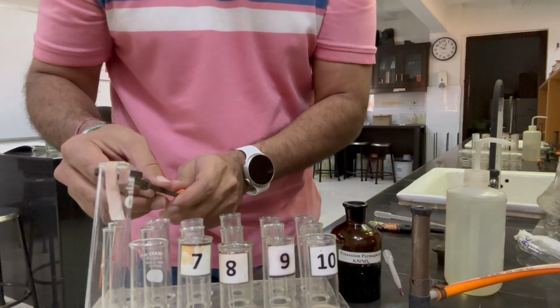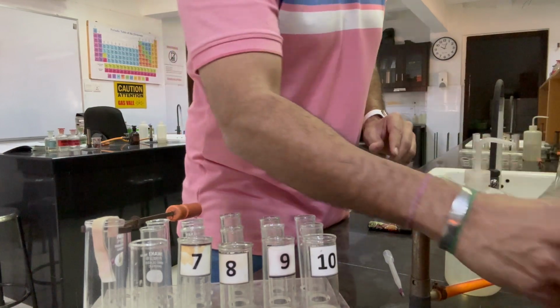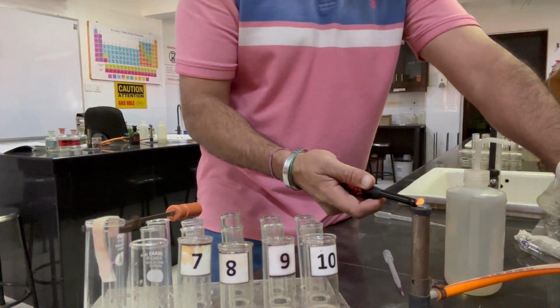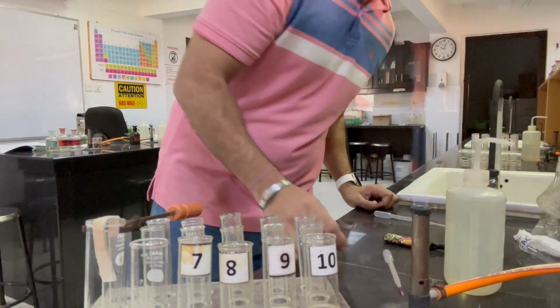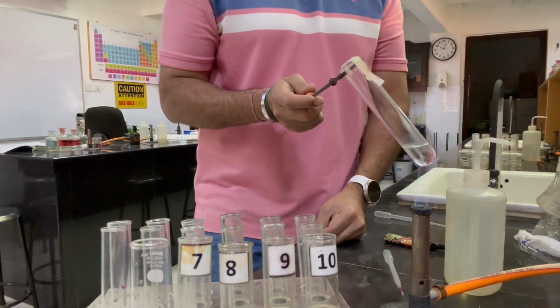Now let me switch on the burner. Put the chemicals aside while you are heating anything. Now let me warm this a bit.